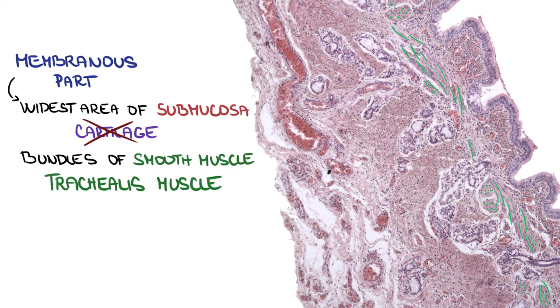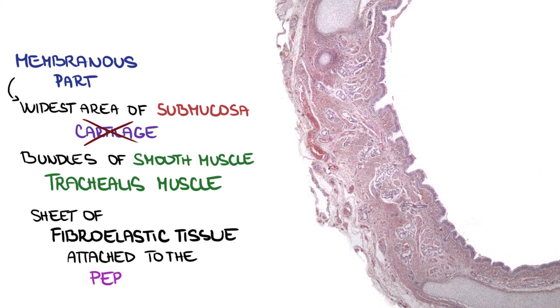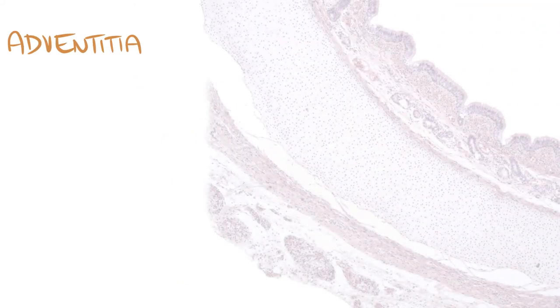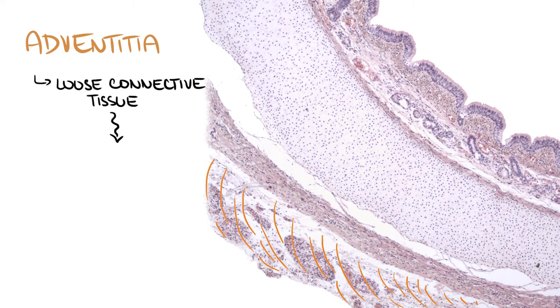There is also a sheet of fibroelastic tissue attached to the perichondrium of the cartilage, but we cannot see that very clearly here. There are many seromucous glands in this area. Adventitia comprises loose connective tissue, which is continuous with connective tissue in the mediastinum.